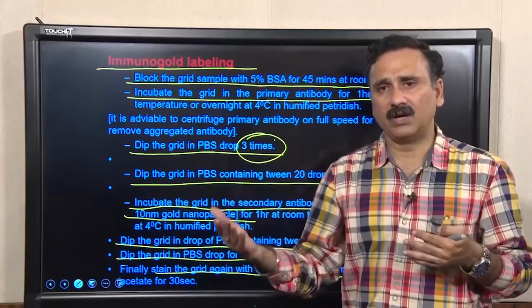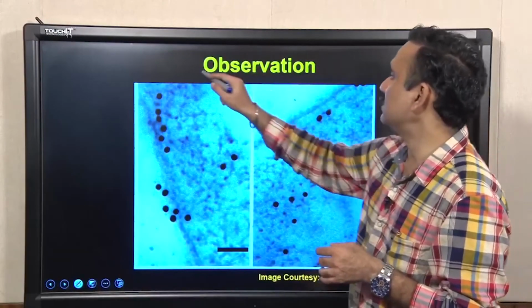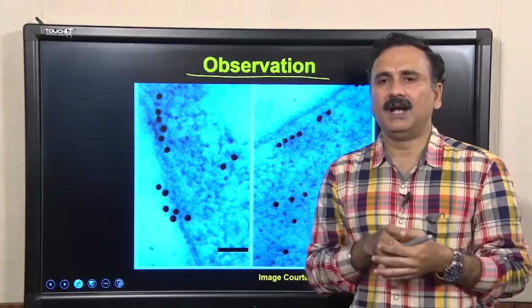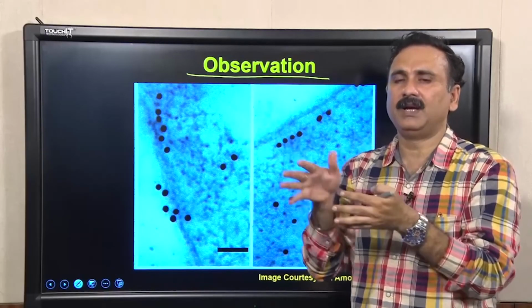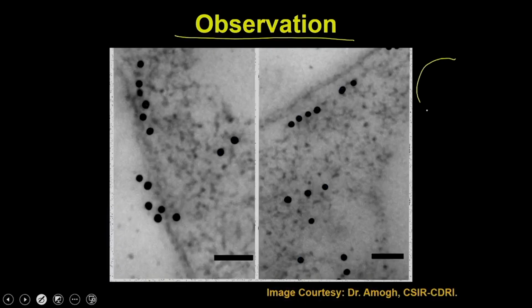the morphology of the different organelles. And then you are going to charge the grid into the transmission electron microscope, and once you insert it into the microscope, it is illuminated by the electron gun, and that is how the electrons pass through, and wherever the electrons will not pass through. So, for example, this is your sample and these are the places where you have the gold, right.